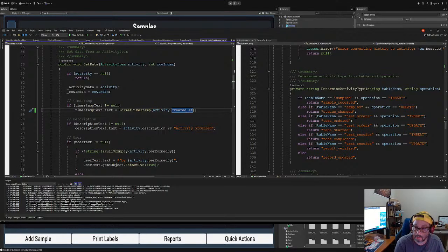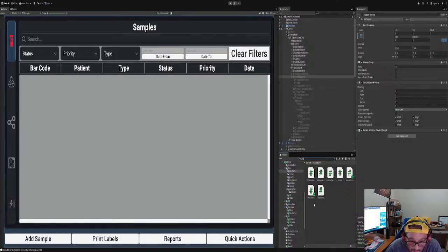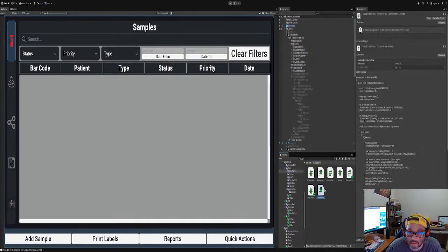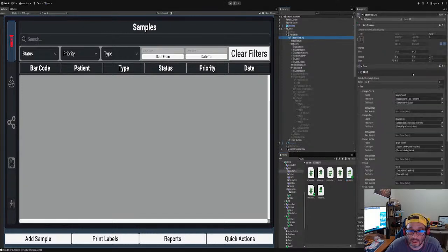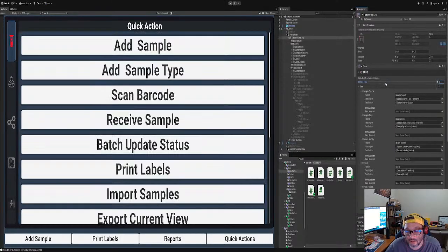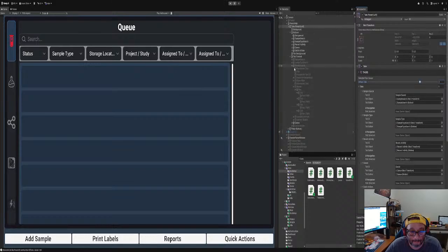Let's see. We look for Q. Oh, sorry. Gotta make this smaller. Okay, so we have Q row view, Q panel. Okay, so we're gonna go over to here, and we're gonna go to the Q panel, which is the second to last. Nope, that's not what I want. Yeah, that's what we want. Okay, Q panel. Q. There we go.